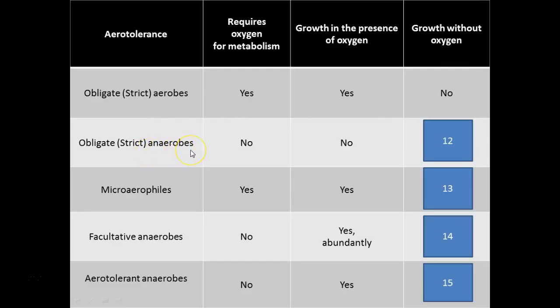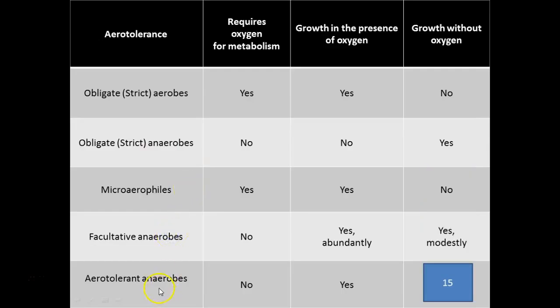Anaerobe. So can a strict anaerobe? Yes. Can a microaerophile? No. Can a facultative anaerobe? Yes. Can an aerotolerant anaerobe? Yes.